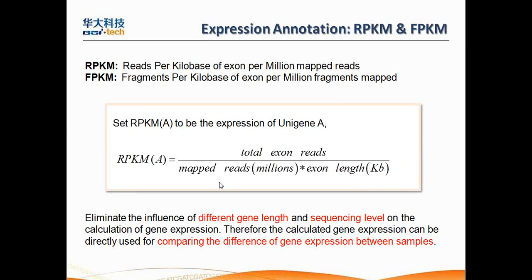So this is the formula used to calculate the RPKM value.